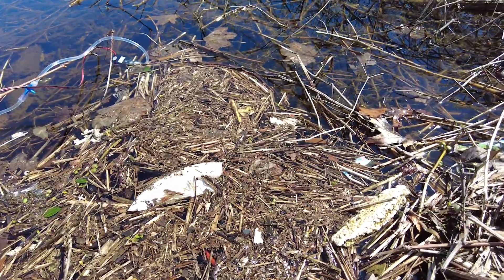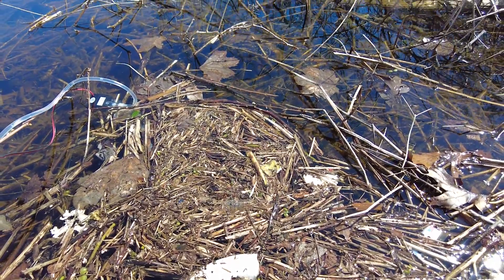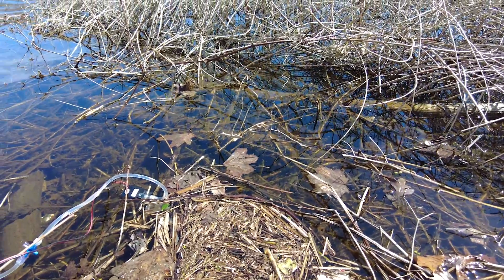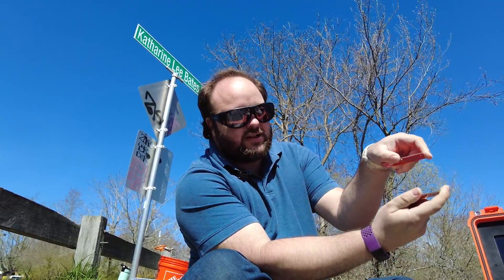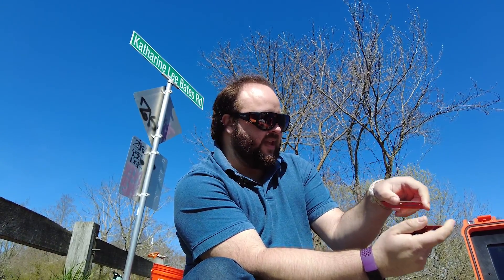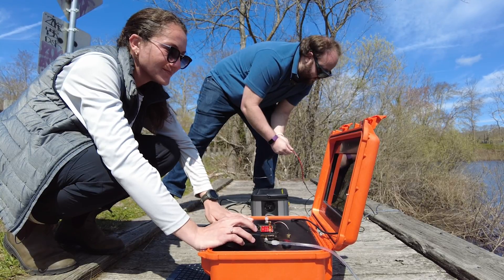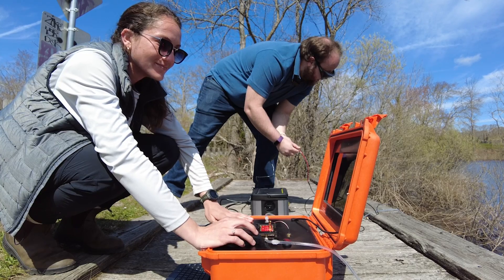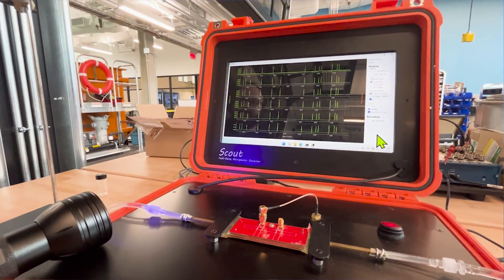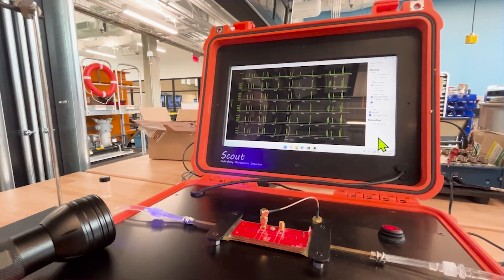The way Scout works is we're flowing water through this flow cell. It's got two sides to it where we're sending an electrical signal across — sort of like a sandwich — flowing water through that gap, and as particles go through there they interrupt that electrical signal. This works because plastic and biology have inherently different electrical properties, so when biology or plastic pass through, they show up with different signals on the screen. For example, plastic shows up as an upward spike and biology shows up as a downward spike.